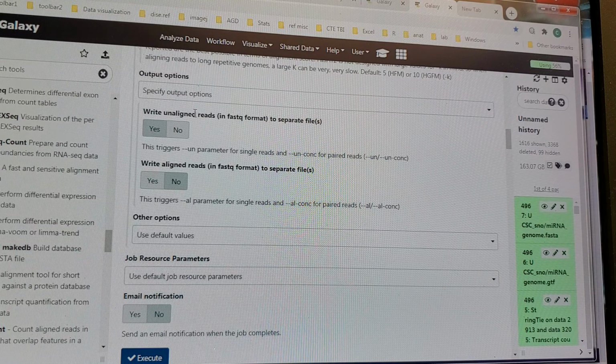Contrarily, if you do a blast and you come up with prokaryotic stuff or actual genes like mRNA, then you'll know that that's okay. It's okay that those were unaligned, because those should have been unaligned if we're just looking at microRNAs.